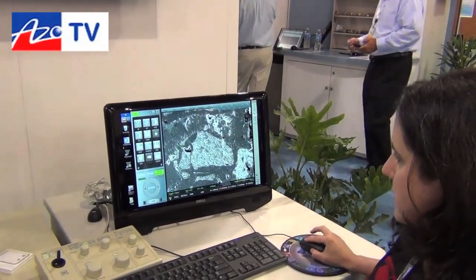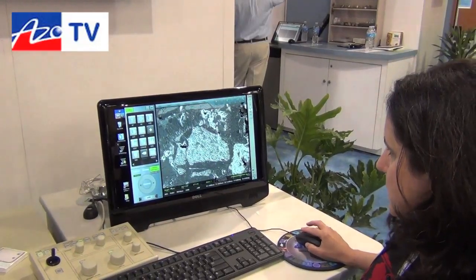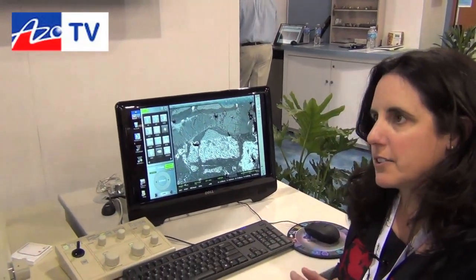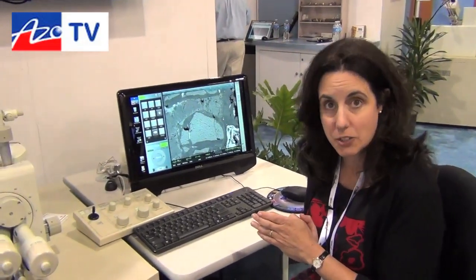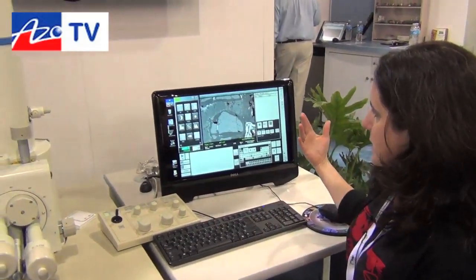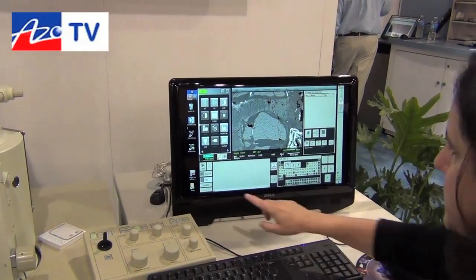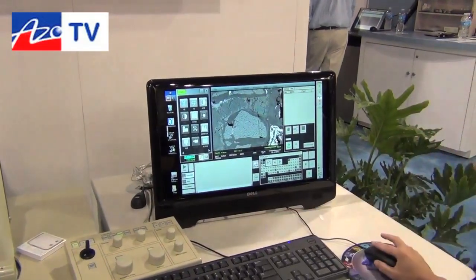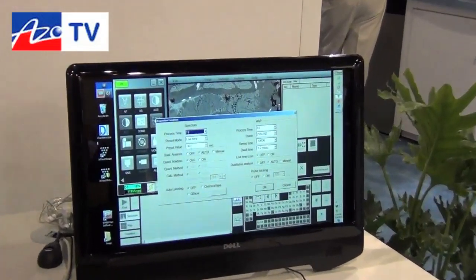I'm going to go back to a standard view with my backscatter. With the 6010LA or In-Touch Scope, we have also integrated an EDS — it's a JEOL EDS system. Just selecting the EDS icon, I'll go into EDS mode. If I wanted to take some quick spectra, I'm going to change the conditions so I can do this fast.